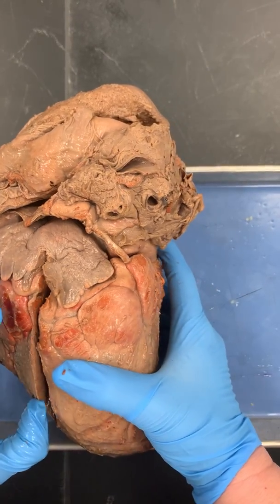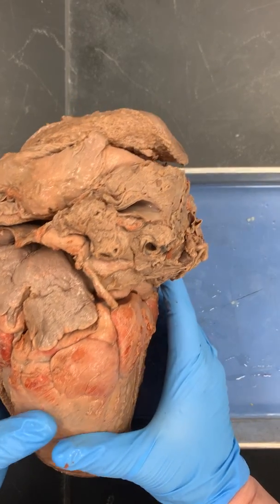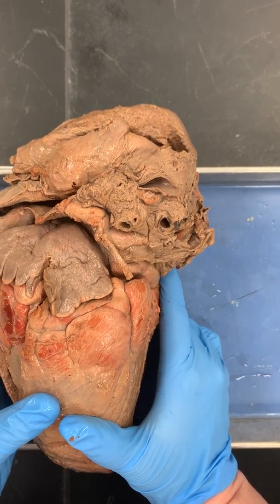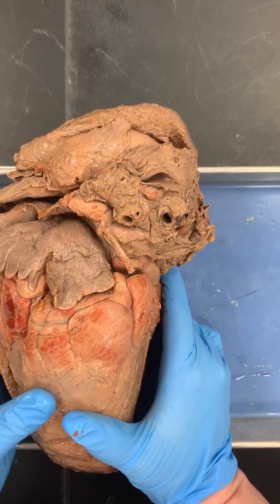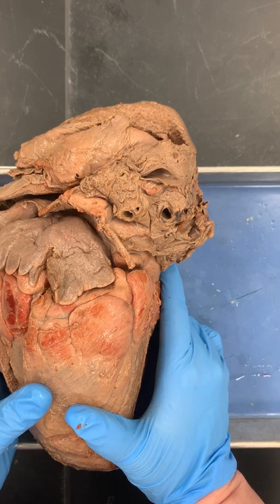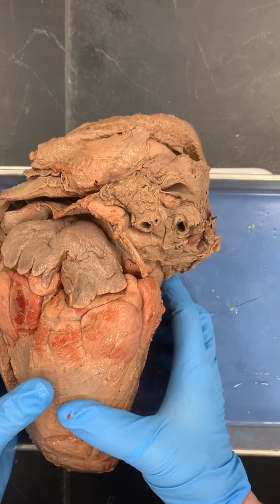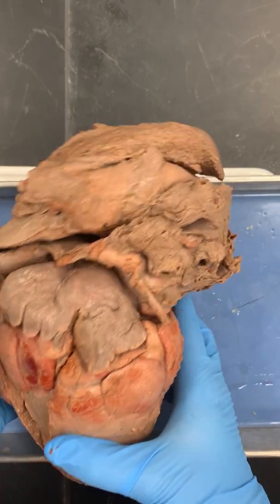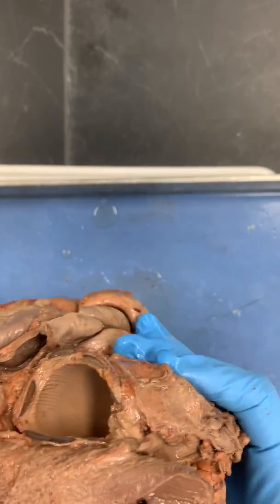Oxes are a lot larger than humans or sheep, so the bigger the animal the bigger the heart. On the blackboard I have a photograph of a guy on a forklift that has a plasticized heart from — I believe — a blue whale, and it's humongous. The bigger the animal the bigger the heart, because the more blood that needs to get to all the body parts.